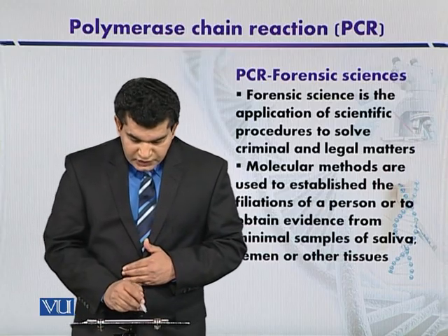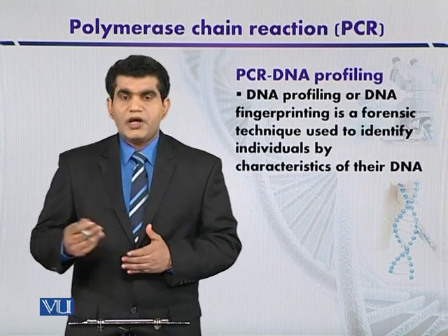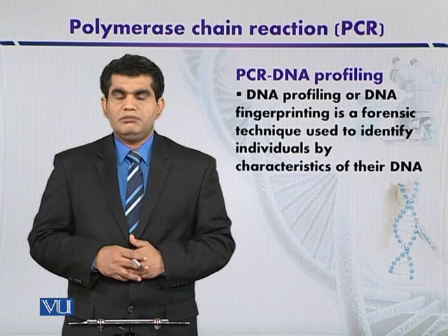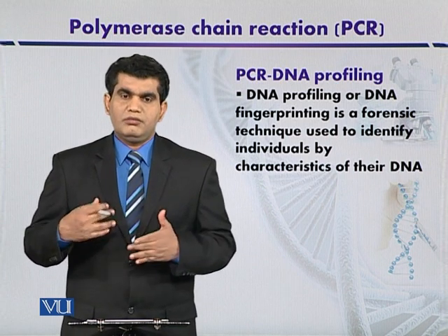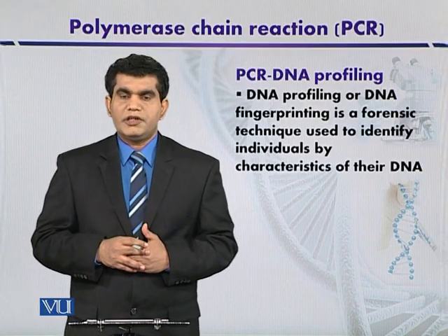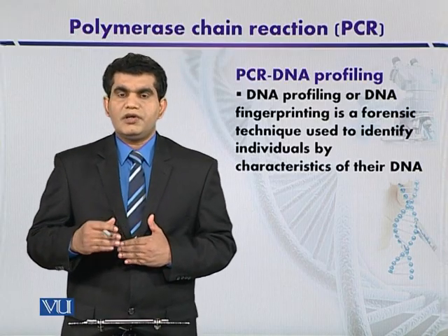And this technique we can now also call DNA profiling, or the more common term that is used, DNA fingerprinting.